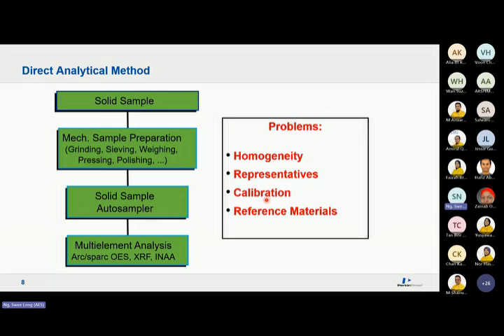I hope you understand that, because if we say I don't want to have sample prep, Katrina, you keep telling us you have a lot of sample prep to do. I want to be direct: if I have this powder, I want to compact it and then run it. That also cannot work. We must always think that when doing the calibration curve, it must be representative, because different types of background will cause different types of interferences, which I will tell you about in a later part.